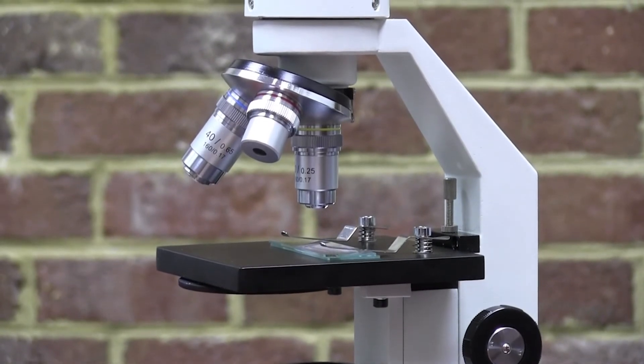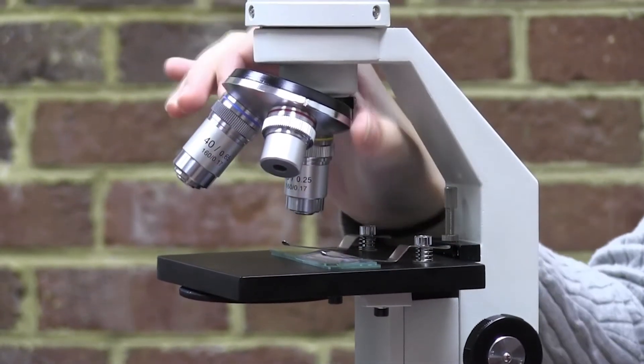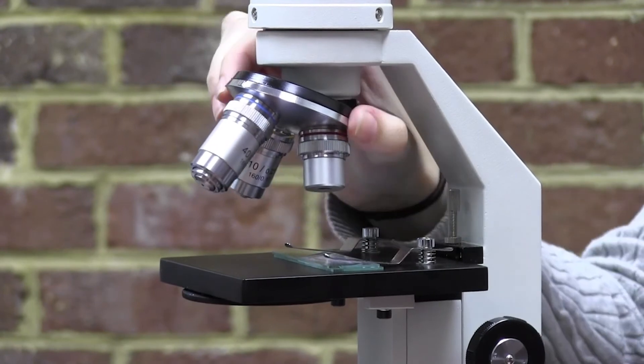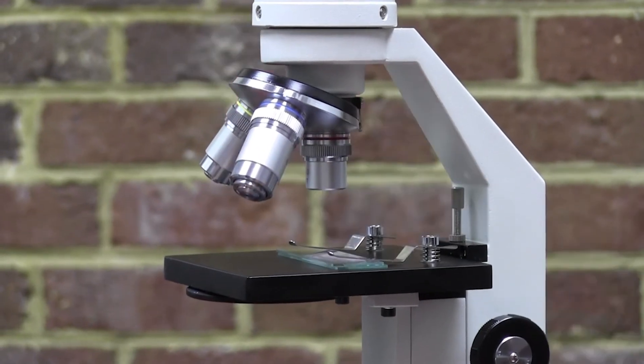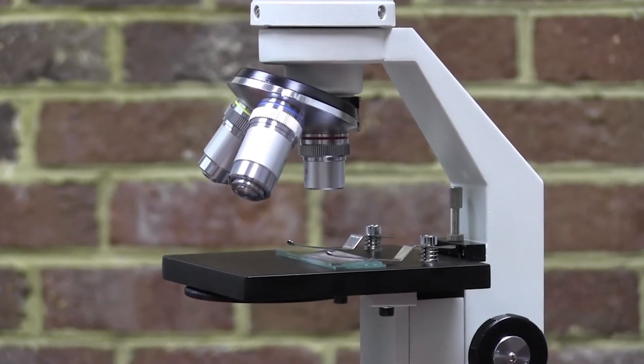Rotate the nose piece until the objective lens you want to use is directly over the slide. The lowest magnification lens is often used when you begin to view a new slide.